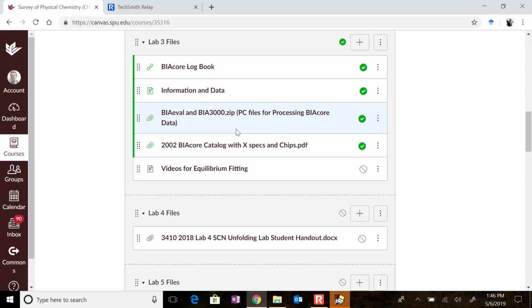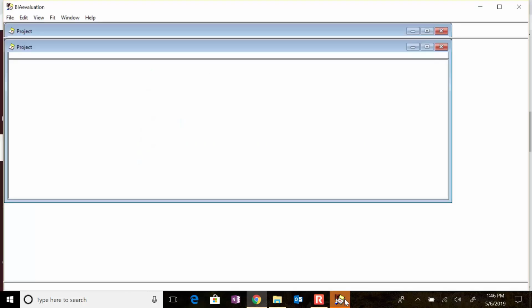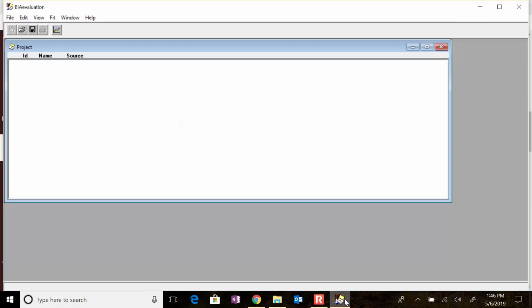Now that you have the data set up, you can start to look at the lab report and the other things you're going to have to do, although it's not due for another 2 weeks. But I do want you to understand that there are some things about the physical nature of BIAcore that are on this PDF. And I will post the video of what we're doing right here so you can see what's going on.